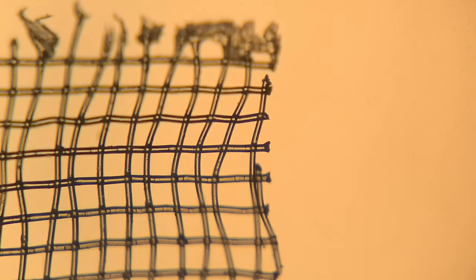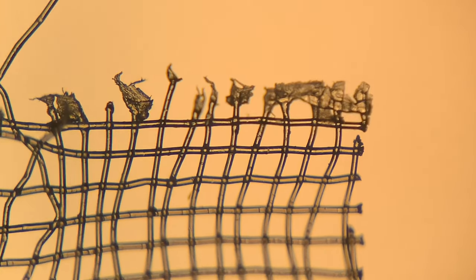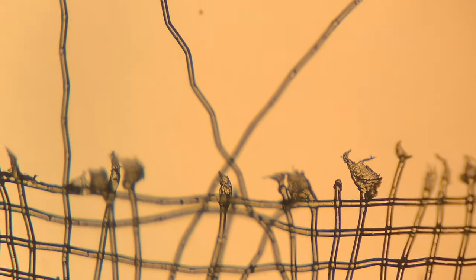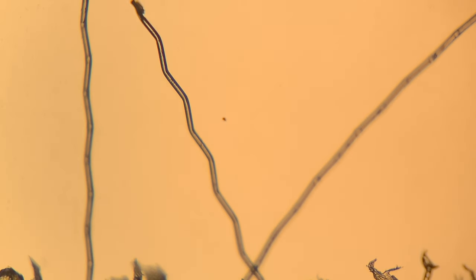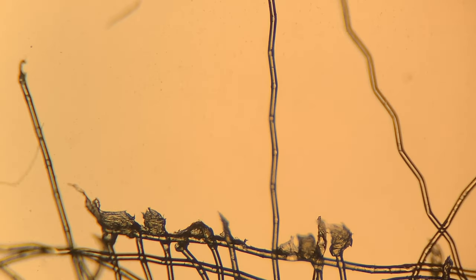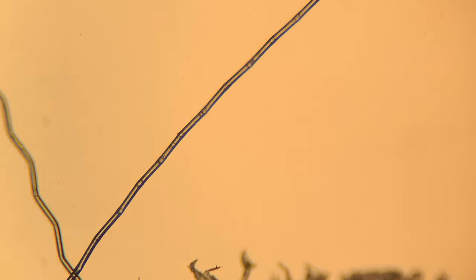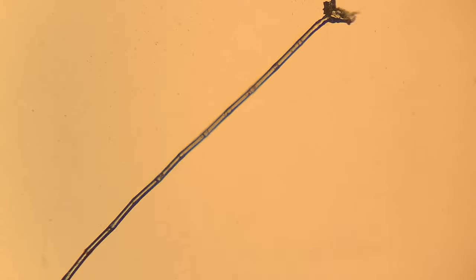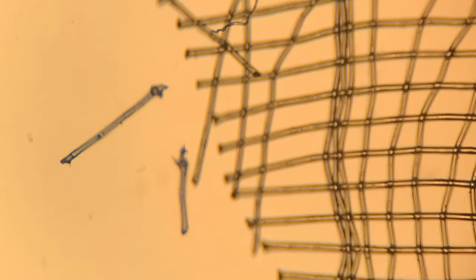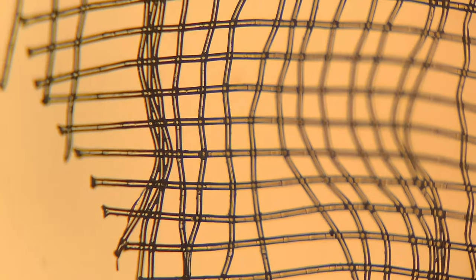At the top here it's not focused — now it's coming into focus. This is the top that I didn't cut; this was probably heat sealed from the manufacturing itself. There are a couple of fibers that were loose, but those might have gotten loose from me cutting as well. As far as the methodology goes, the study said they didn't find any major significant difference between the ones they had cut open to remove the tea leaves and the ones they did not cut open. You guys tell me what you think about this.